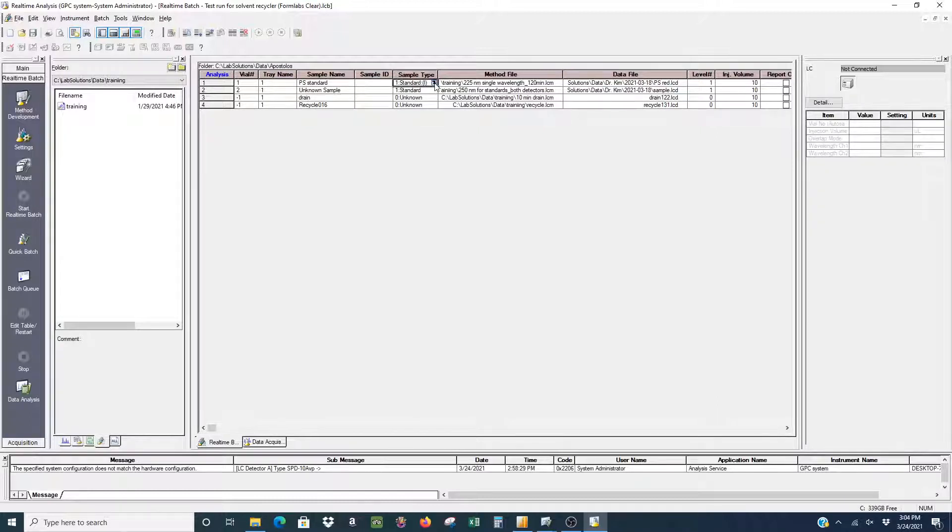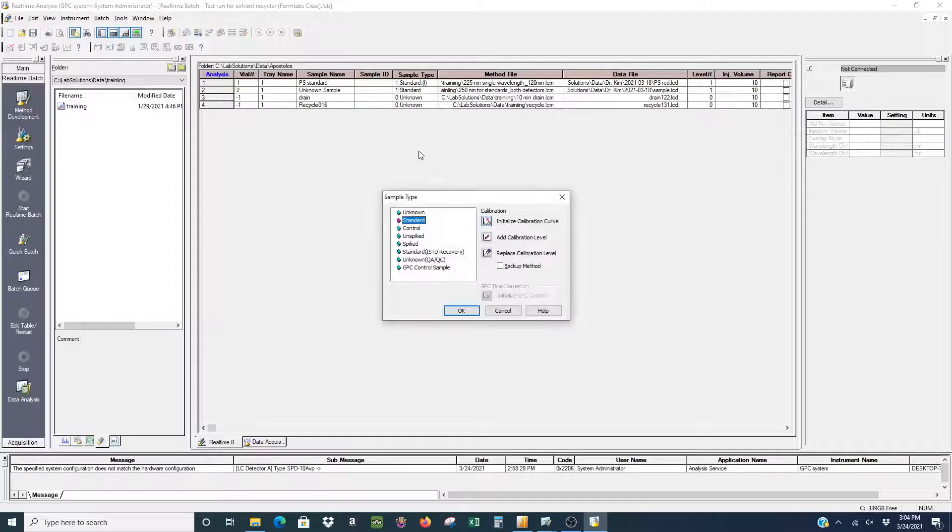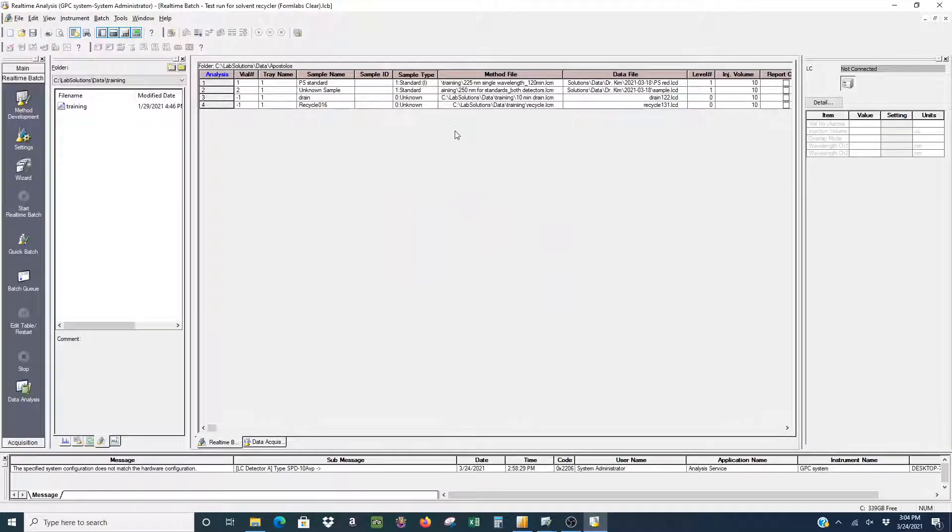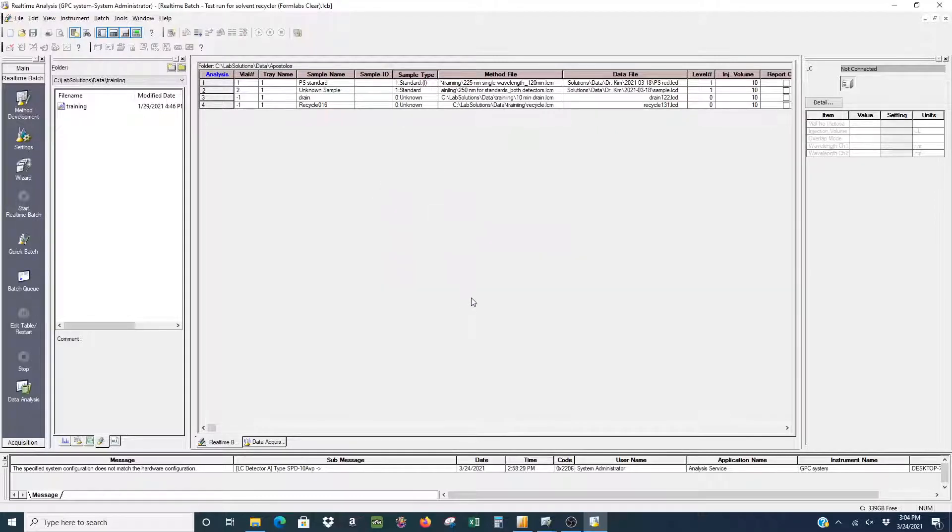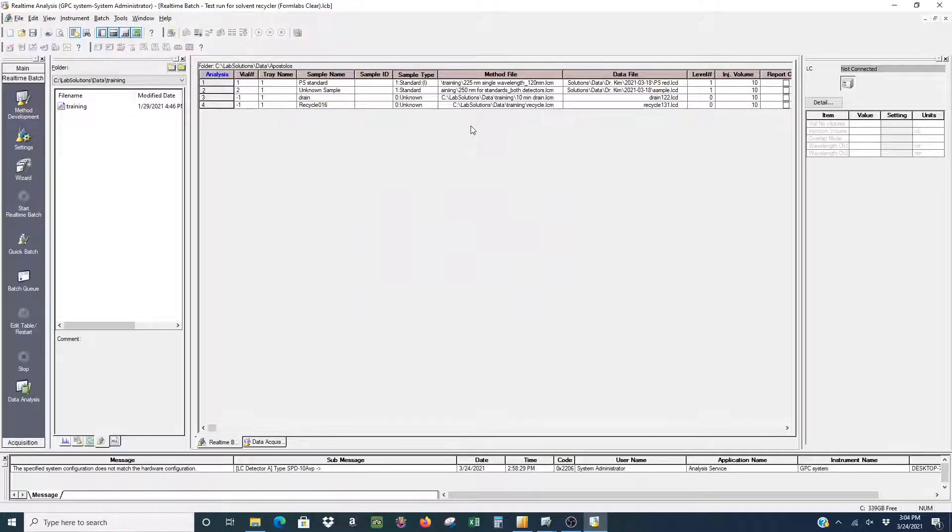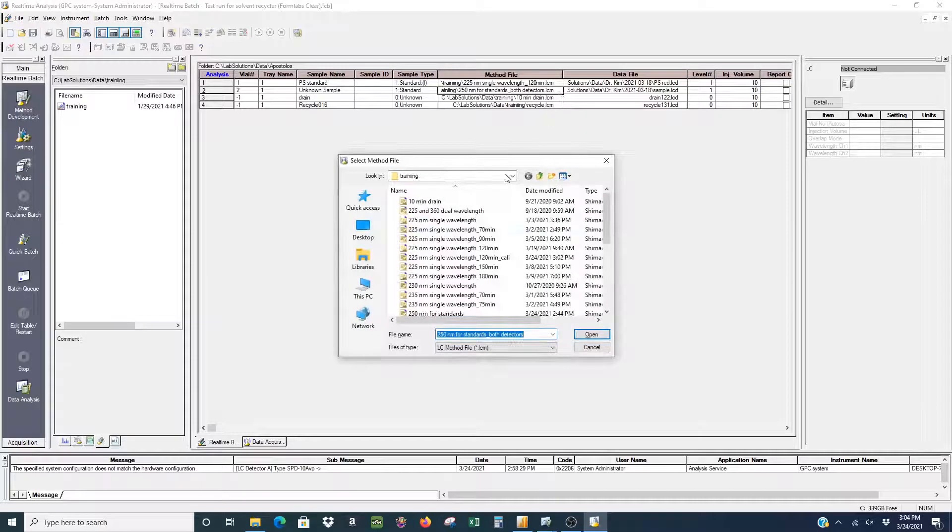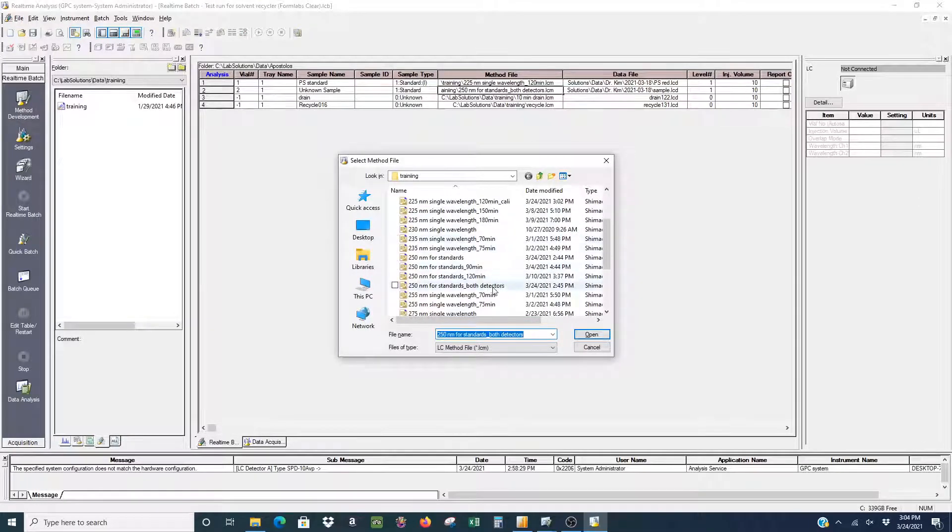You want to make sure that your sample type for the standard or however many standards you have are all set to standard and that your unknown samples are also set to standard. You have to do this because if you have a sample type set to unknown for the unknown sample, only the UV detector will take up any signal. By having it set to standard, you'll have both detector signals.